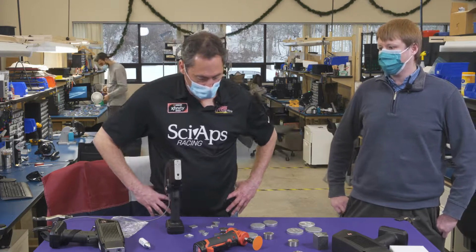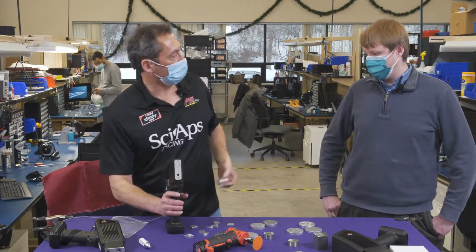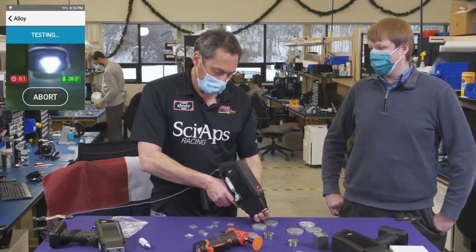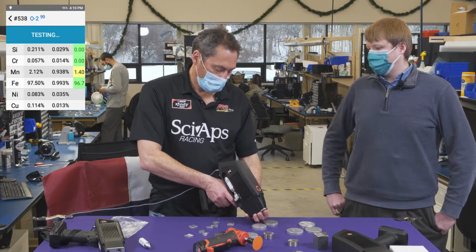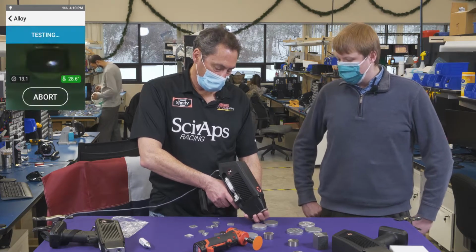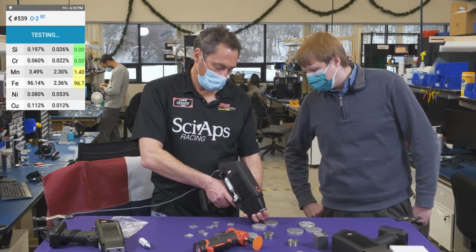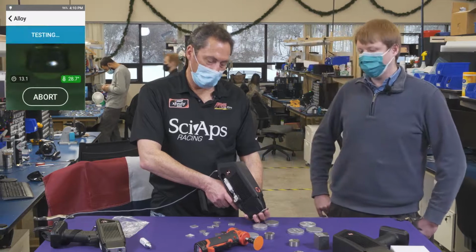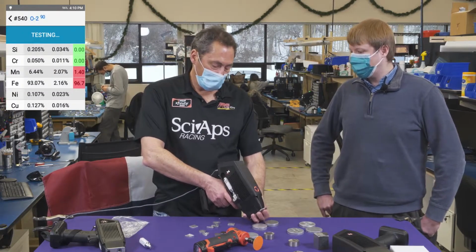Okay, so let's see, what can we shoot here? I brought out a steel. How about an iron? Let's do some ferrous. What do you say? Do a couple of tests. This is just some low alloy steel that I grabbed. So again, just like the carbon unit, it averages several spots, shoots several spots, and comes up with the average.